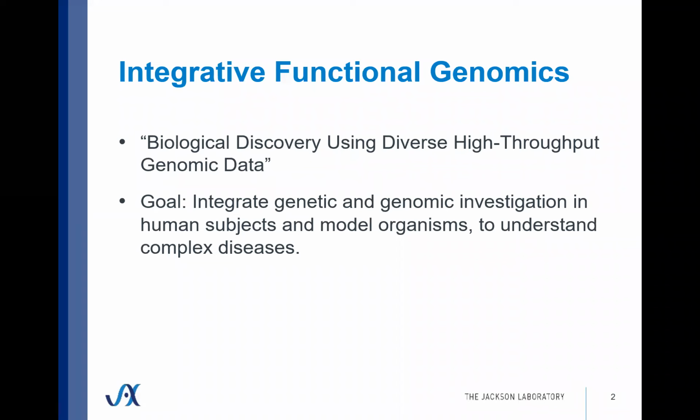And one of the fundamental questions that we want to answer is, how does my research study relate to your study? Are we finding the same genes? And what is conserved and not conserved when we look across the different species? Can we compare different traits across species and ask which traits are relevant to the study of different facets of human disease? And GeneWeaver provides us a platform for sharing data and analyzing it to address these types of questions.